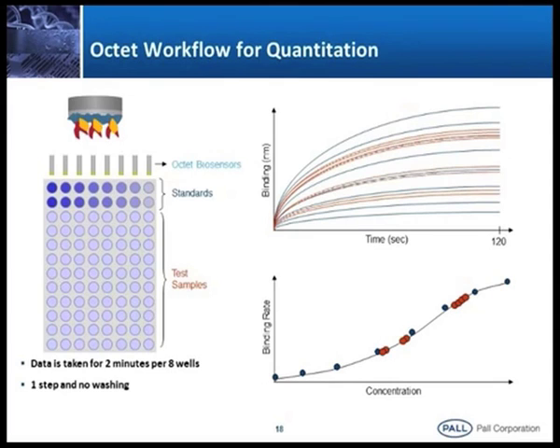But here the advantage is that it is purely affinity based. In the case of UV, I am giving an example, you people are performing the Bradford assay, right? What you are doing is purely total protein quantitation, not exactly the protein of your interest. Even in the case of HPLC, it is monitored at 280, it is once again resolving, but even then you do not know how pure your peak is. There may be some other proteins which have the same hydrophobicity, and they will elute at the same time.